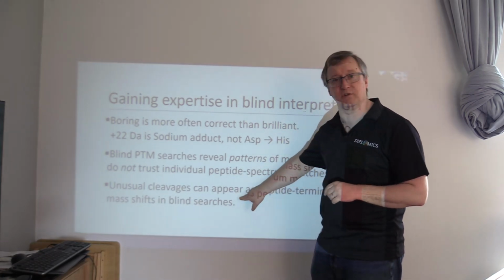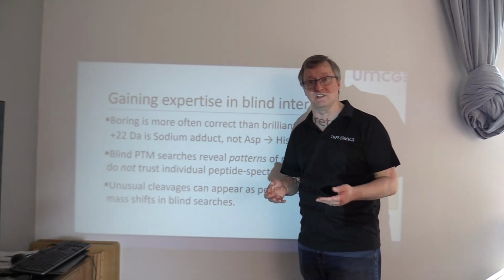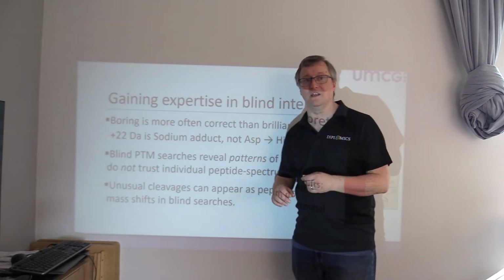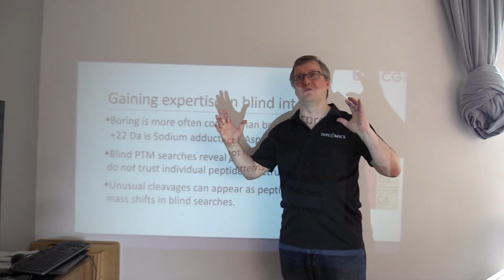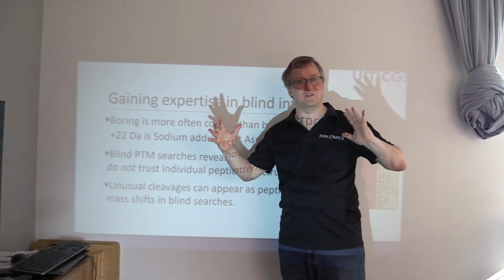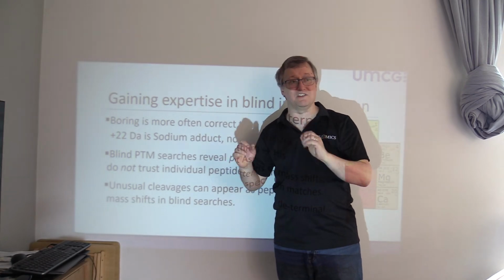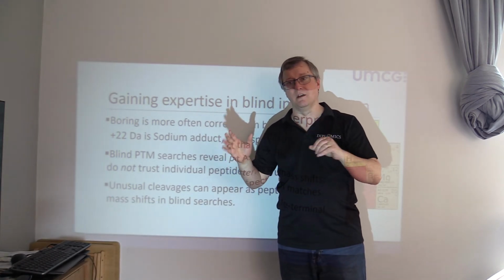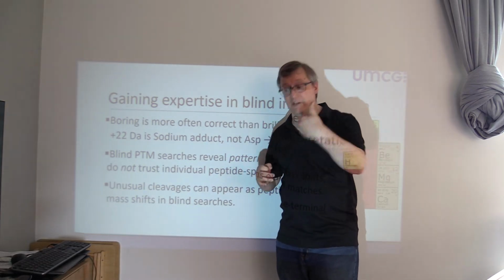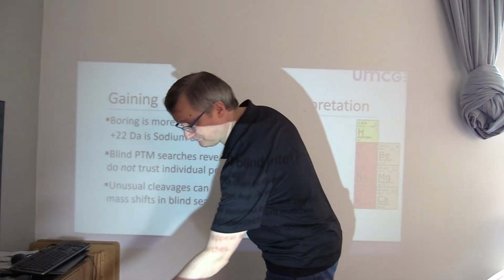Keep in mind also that there may be something other than trypsin causing digestion points within your proteome. If that's the case, what looks like a negative mass shift, a loss of mass on the peptide, might be a semi-tryptic peptide that doesn't make it all the way to the next trypsin cutting point because another mechanism led to the cleavage of peptide bonds.